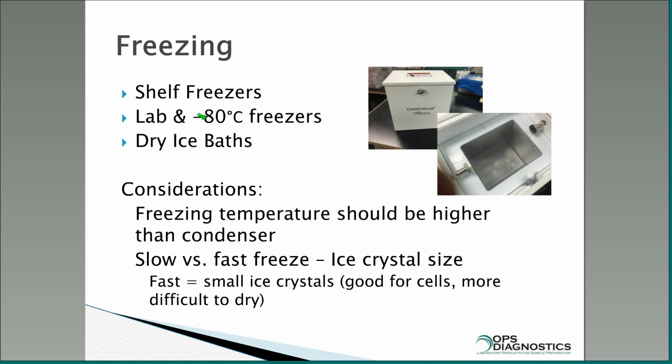All right, you can use a shelf freezer like I showed in the shelf dryer, and that can go down to like minus 40 or so. Good temperature. You put your samples in there. Temperature drops over time. You can program it, and your samples will freeze. Or you can use a lab or a minus 80 freezer. You can put your samples in there just in a tray and let them freeze.